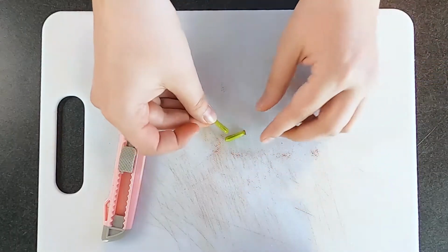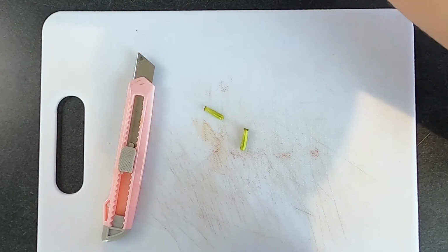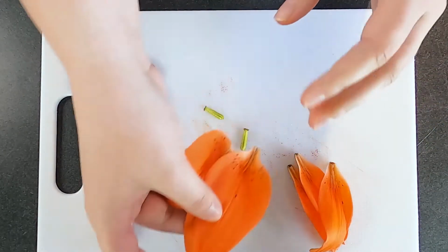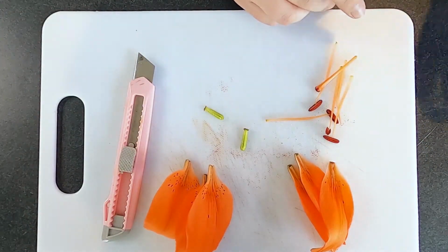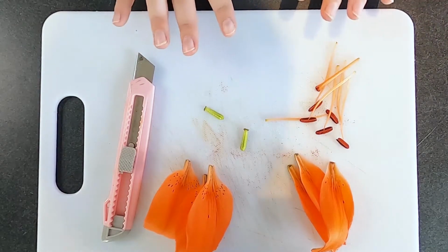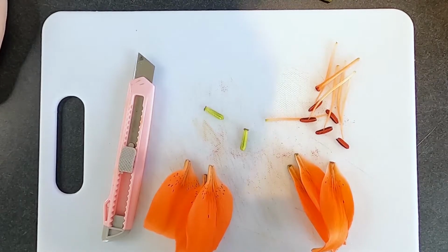And so when they become seeds, all the other parts of the flower are going to fall off. So we have all the petals and the sepals, and all those kinds of things are going to be falling off, and we will eventually have a seed, which will be able to grow into a new flower and do the process all over again. So that's the basics of all the parts of the lily.